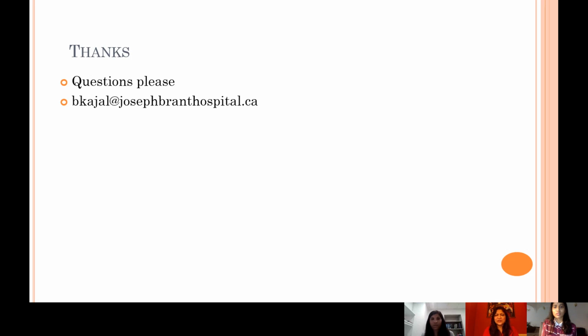And I have a question for you, please. It would be lovely if you can tell us the approach to a bone marrow biopsy for histopathology reporting.